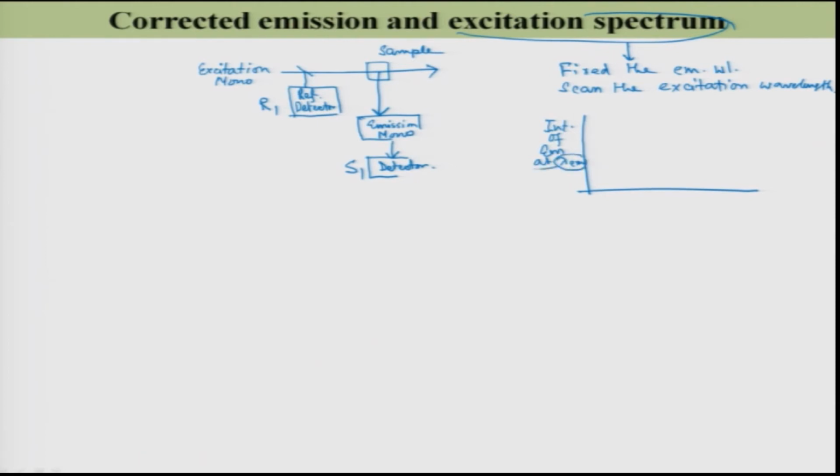So, whatever you have fixed over here, versus lambda excitation, that will scan in the excitation monochromator. So, here is your lambda excitation.